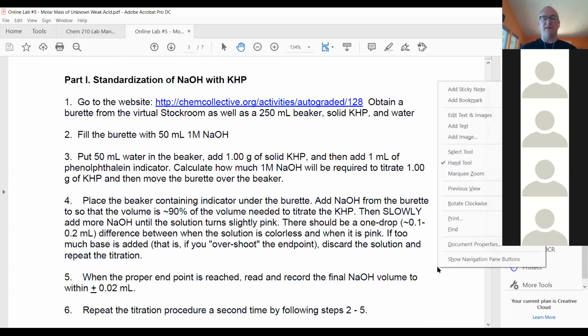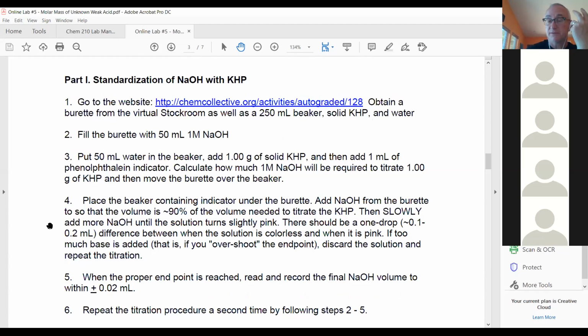All right. So, as I mentioned, when you make a concentration of an acid or a base, you're not going to know precisely what it is because of the presence of carbonic acid, the presence of extra H+. So what you do in that situation is add a known amount of acid, in this instance, KHP. We use that because it doesn't react with anything until you put it in water, and you can measure the mass very precisely. So we're going to dissolve that in some water. We'll weigh some out, put it in a beaker, and then we're going to fill a burette.